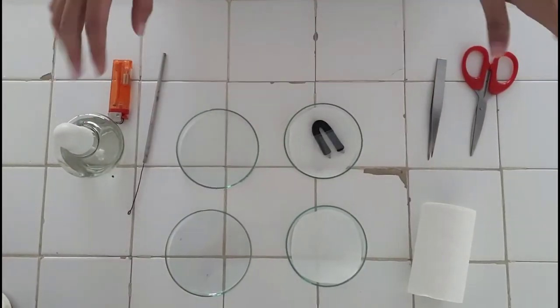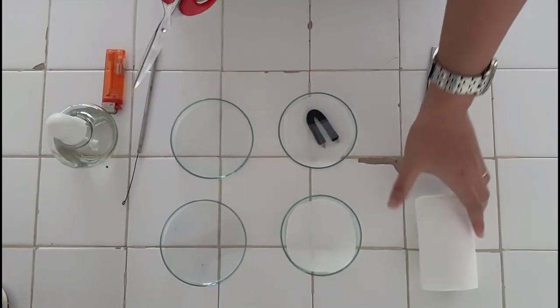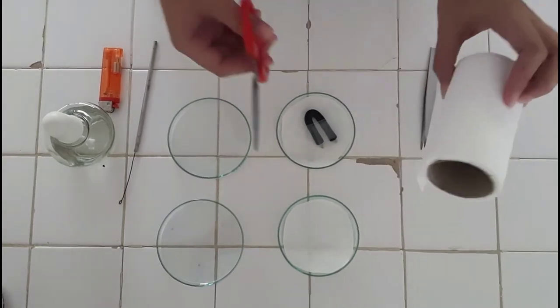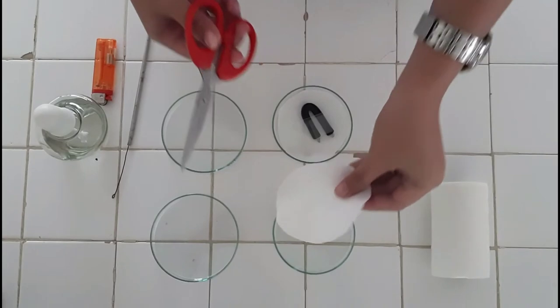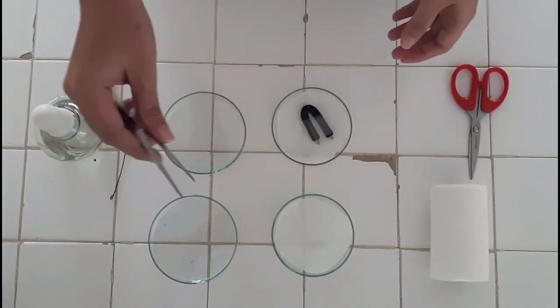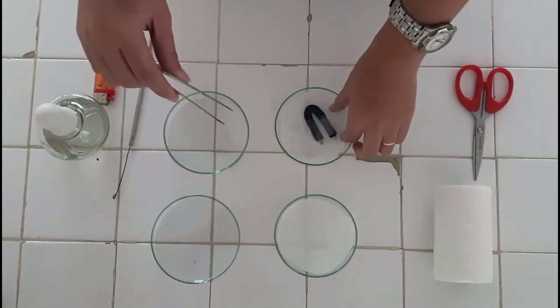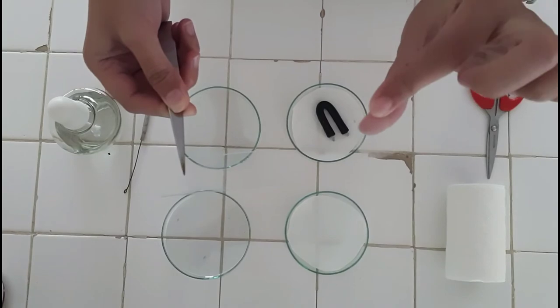Here are the materials that we're going to use for this exercise. Scissor to cut the tissue paper as an alternative for filter paper. Use it to cut it round. Tweezer. Glass slide. And a cover slip.